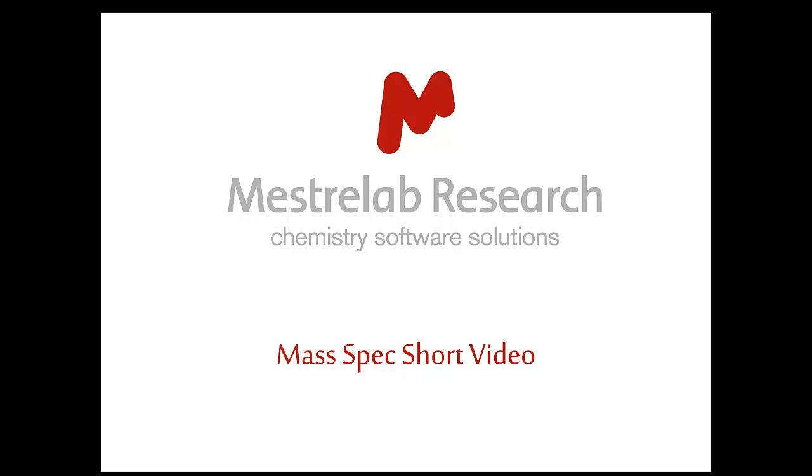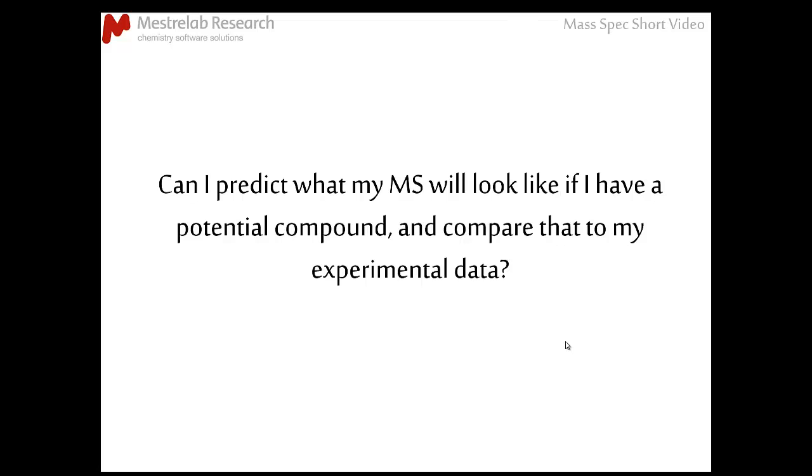At the IMSC conference in Geneva today, an Mnova user asked me a question which I thought many other Mnova users may be wondering about, and therefore I decided to make a video about it. The question was about the mass spectrometry functionality in Mnova, and it was basically, can I predict what my MS will look like if I have a potential compound and compare that to my experimental data? So, what would this look like in Mnova?